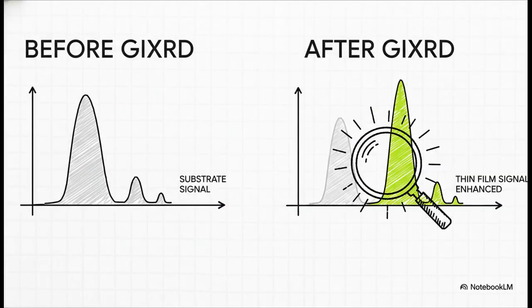And what's so cool about this is what it accomplishes. It essentially filters out all the noise. The signal from that thick material underneath, the substrate, is usually overwhelming.